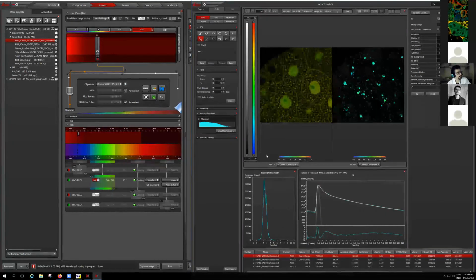Yeah, sure. So now I hand it over to Connie, who is going to present the data, and also explain some of the parameters and what we have found. Connie?